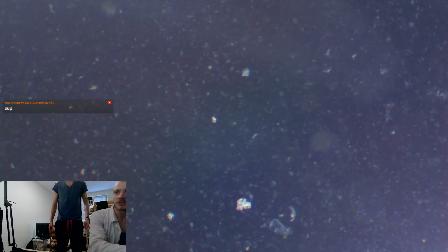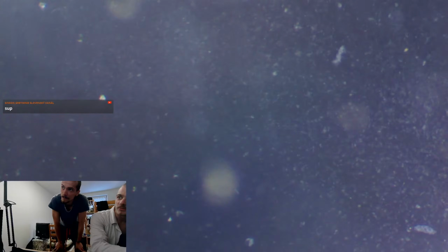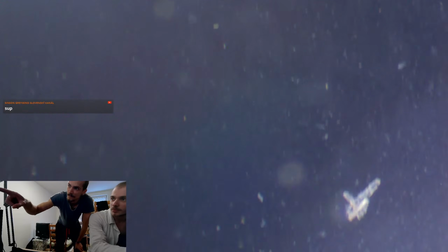I'm looking now at ostracoda. I'm gonna try to find it. Yeah, that was it. That big one right here. But it is pretty fast, so I just probably need to take more water from the specimen. What more is this? Probably some sort of crystal.